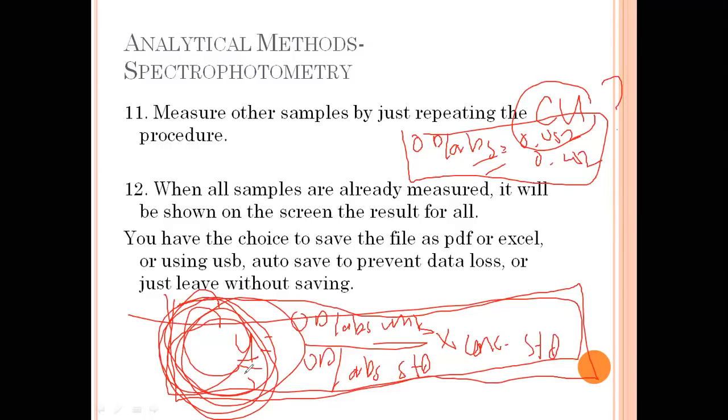When we proceed with analyte measurement, by next week, when we measure your glucose, you will see what that formula is for. Why does Ma'am Kat keep telling us to remember the formula? You will realize it when we come to the analyte measurement in the laboratory. Okay, in the lab.